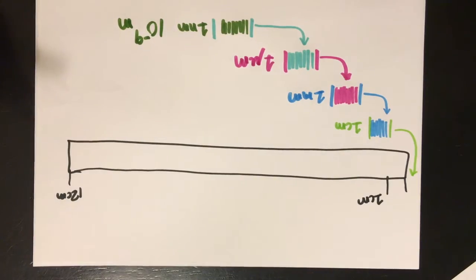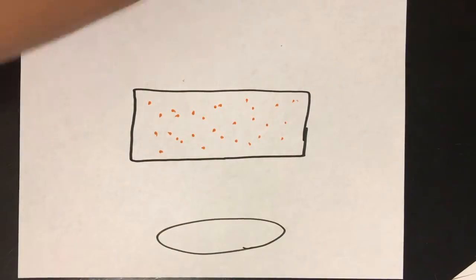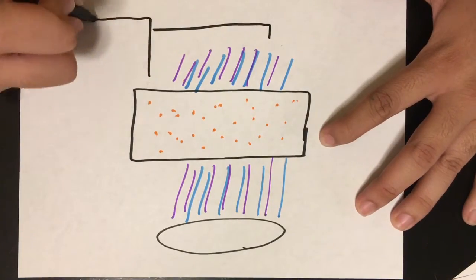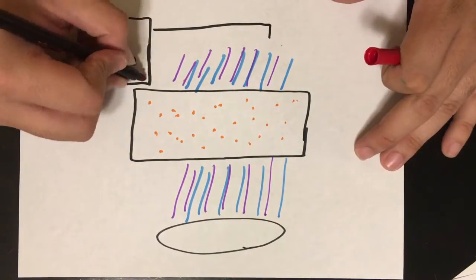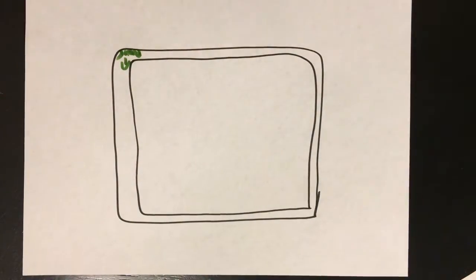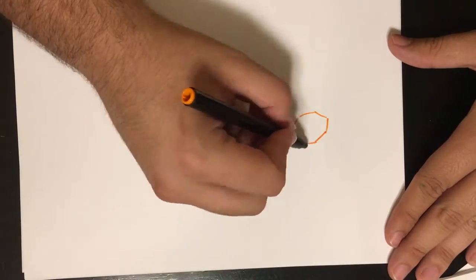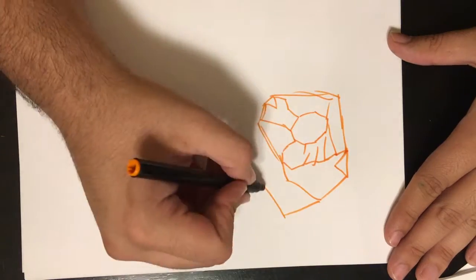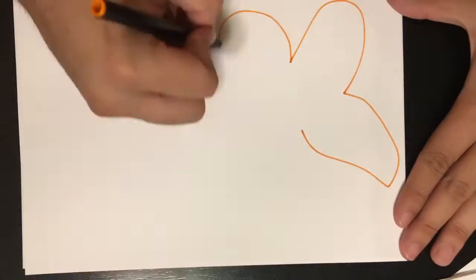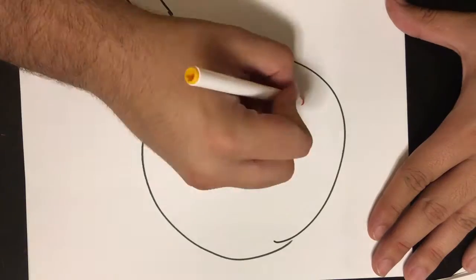Here is an example of gold on a sample plate. To the naked eye, it looks like a sprinkle of gold dust. However, under an electron microscope, we clearly see the surfaces and structures of our gold in different shapes. We can further our understanding of compositions of elements and biological matter, from viruses to butterfly wings, all under the electron microscope.